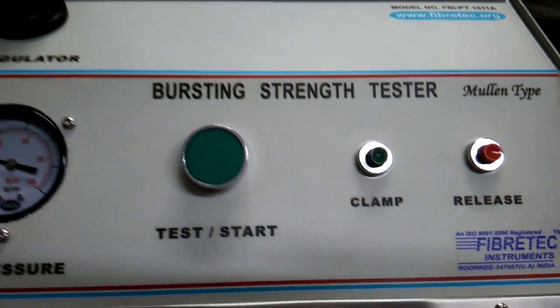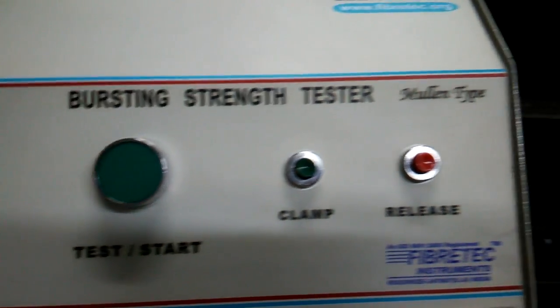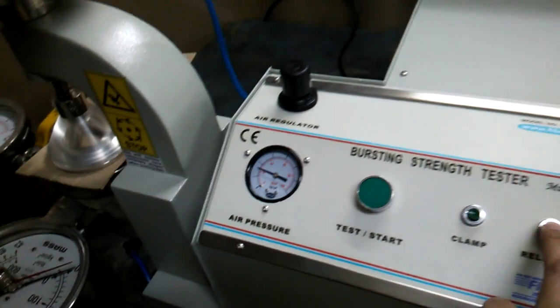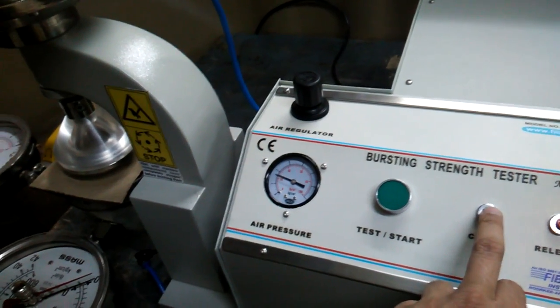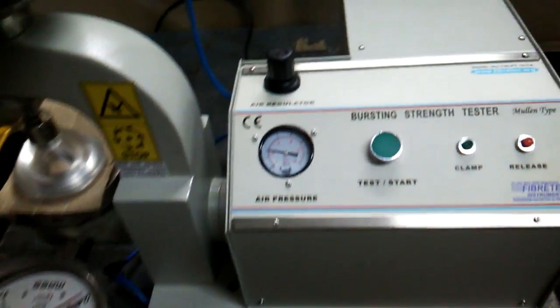This is the switch to start and stop. You can test the same specimen here. This is how you clamp and release — by pressing it you can release this, and by this you can clamp the specimen. Here is basically the inlet of the pressure.